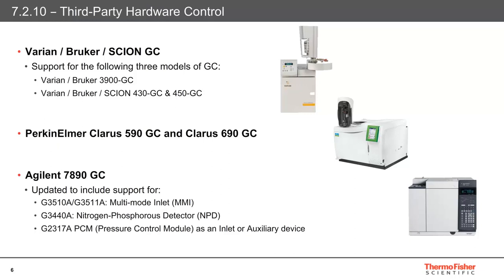Concluding the improvements for third-party GC control, there's an updated driver for the Agilent 7890. This includes support for the 3510A and the 3511A multimode inlet, the G3440A nitrogen phosphorus detector, and the pressure control module, the G2317A. This will expand on the instrument's capabilities for sample analysis.